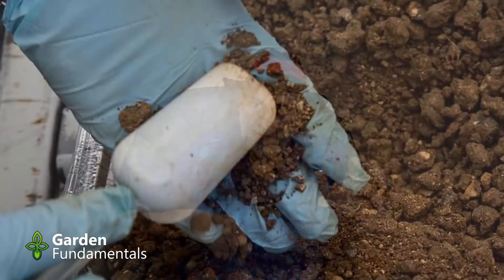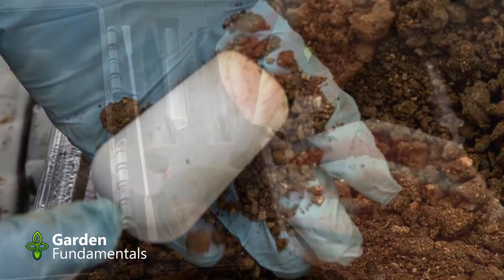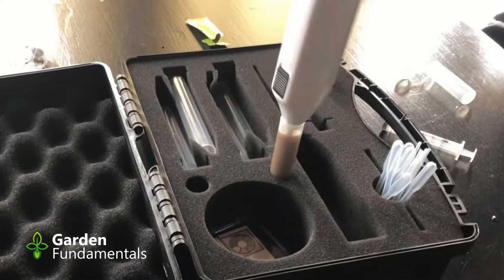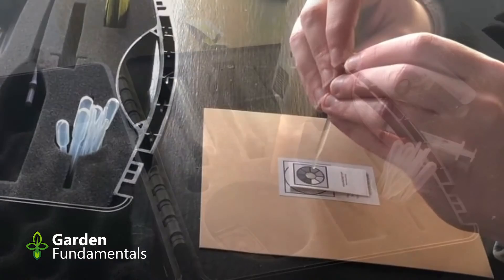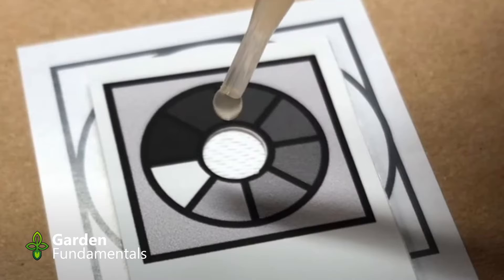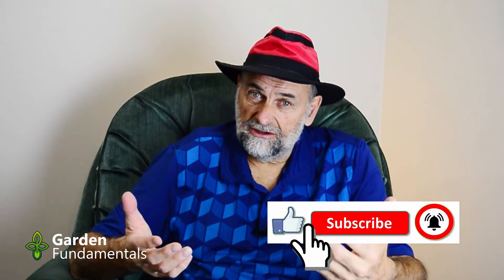Running a test is pretty simple. Collect your soil sample, take a measured amount and put it in a test tube, add a little packet of salts, add some water, stir it up, and wait. Then put a couple drops onto a special card that's part of the kit, take a picture of that, and the free app you can download will do all the analysis and give you the results.